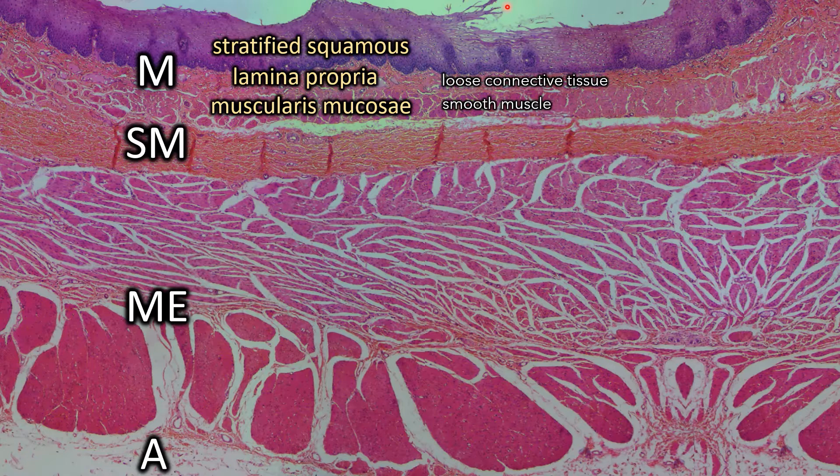The submucosa is only one layer, and it is made of a dense irregular connective tissue. There are esophageal glands in the submucosa, but we can't see any here. All these openings that we're seeing are actually just blood vessels, which you can tell more clearly when we're looking closer, which we will do in a second.